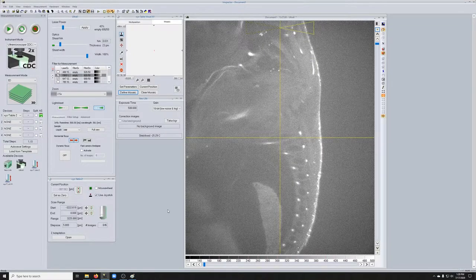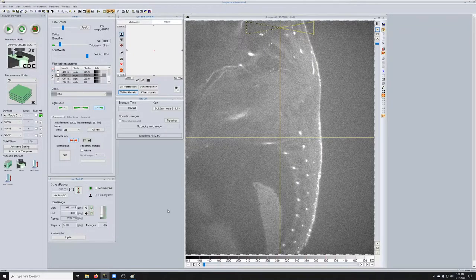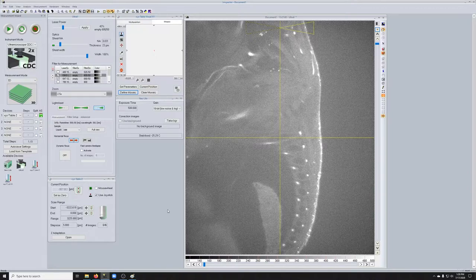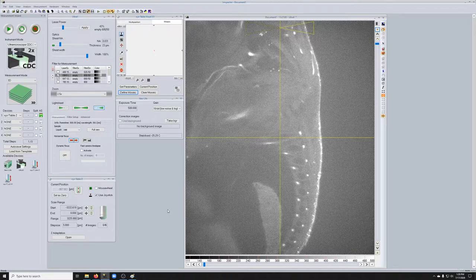So let's say we want to do tiling. Frequently when you're doing tiling, the reason is that you want higher resolution of something that's bigger than what can fit in the field of view.